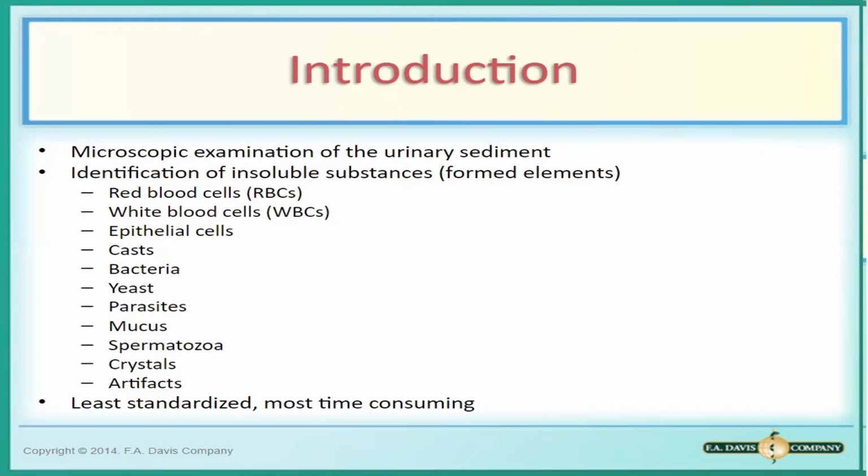Okay? This portion is the least standardized and most time consuming. So how come na least standardized? That's because it is a subjective portion. It would depend sa iyo as a medical technologist. Siyempre, iba-iba naman tayo ng paningin. Since ang identification is visual based sa kung anong alam mo at kung anong pagkakita mo, iba-iba tayo ng paningin. And also, for example, binasa mo, tapos binasa ko, hindi ko naman makikita lahat ng fields na exactong yung nakita mo, di ba?